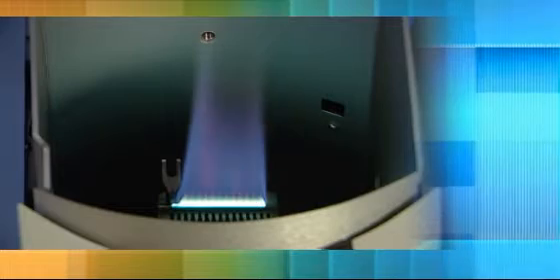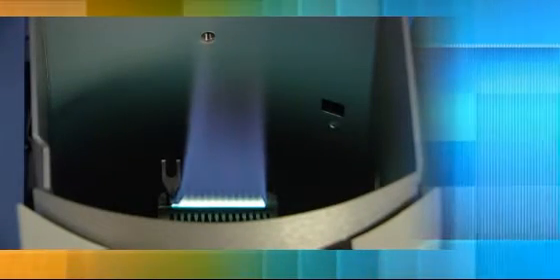To obtain the best results in atomic absorption spectrometry, optimisation of the flame composition is essential. Changes in fuel to oxidant ratios adjust the flame temperature and this plays an important role in analyte sensitivity and the effect of interferences.